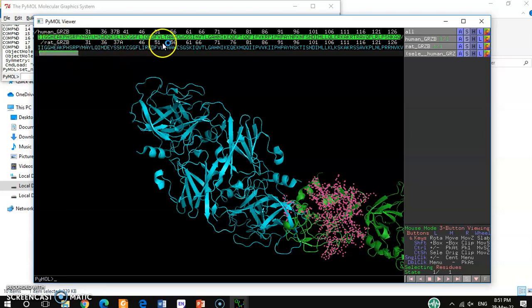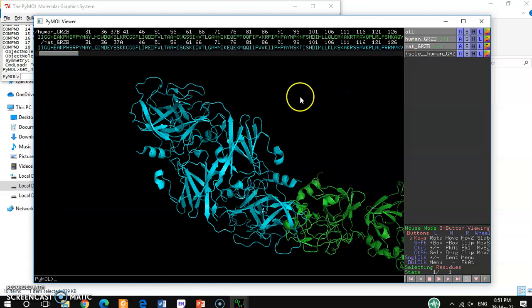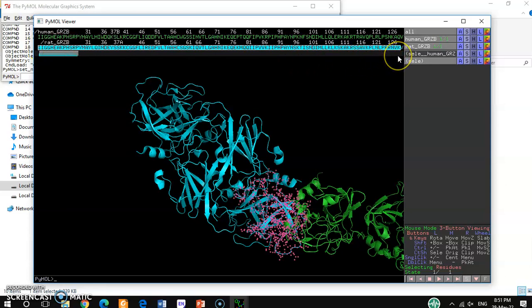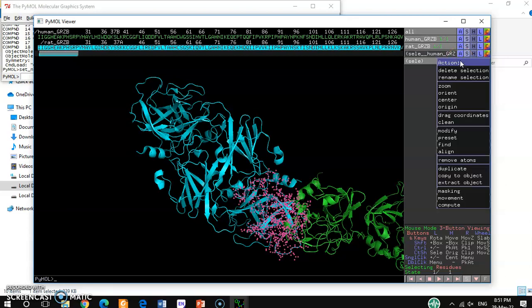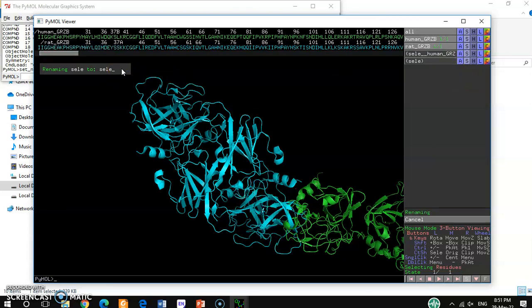This one part is already selected. For the other structure, that is rat granzyme B, I also want to select that part. Then hit the action button, go to 'rename selection', and in the box that appears, write 'rat granzyme B'.